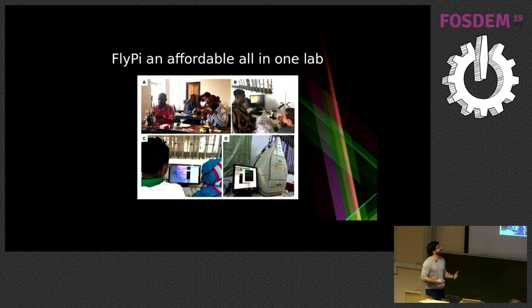It might take a little bit more time. And we've been showing them. First, we started showing how to build these devices, but then we realized that's kind of silly because not everybody needs one of those. So we switched the courses to show them, look, this is how you put an Arduino together with electronics, and you get to do the biological things that you want.